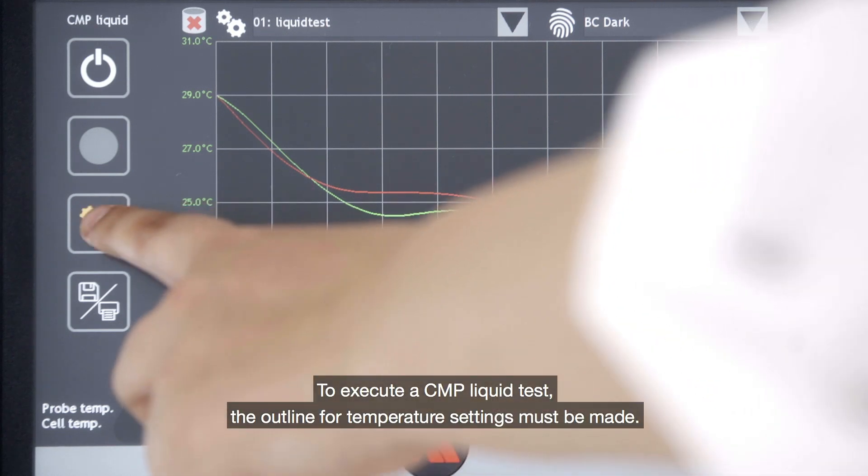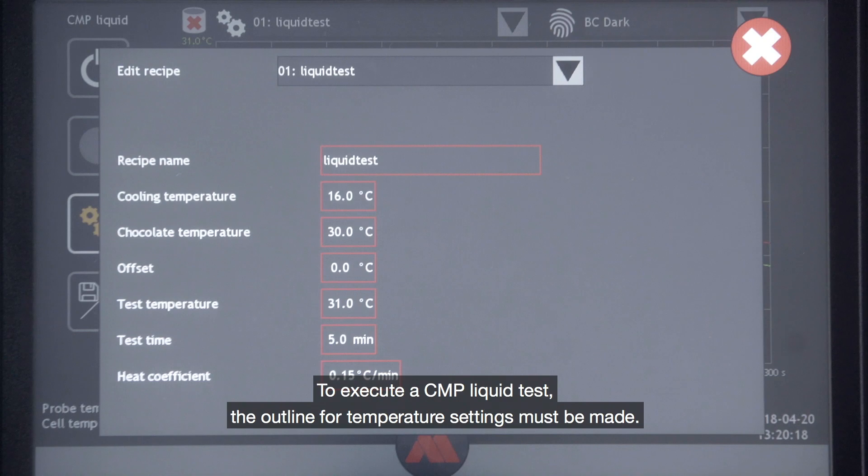To execute a CMP liquid test, the outline for temperature settings must be made.